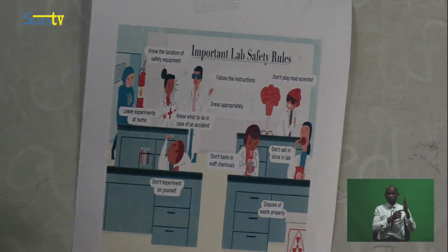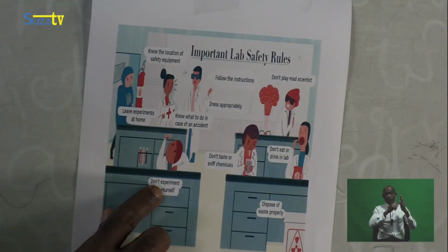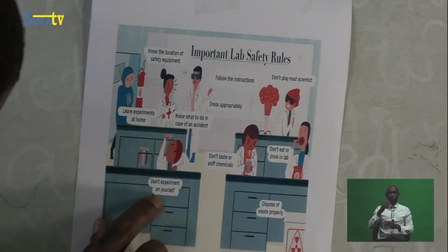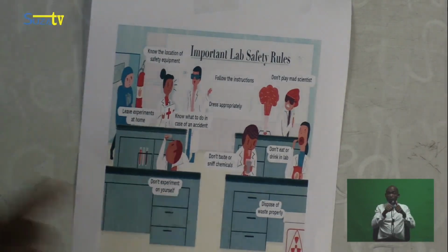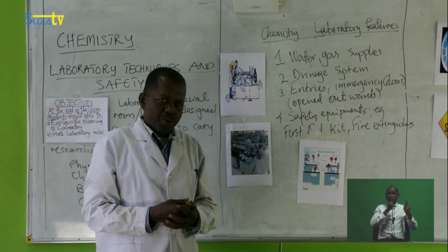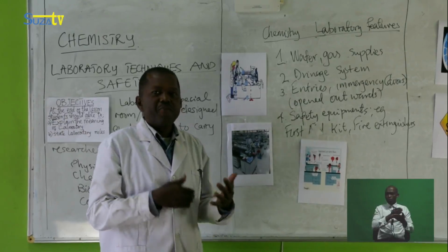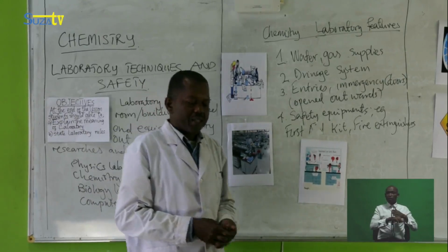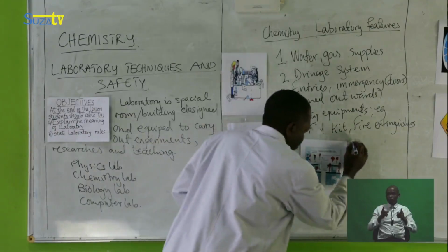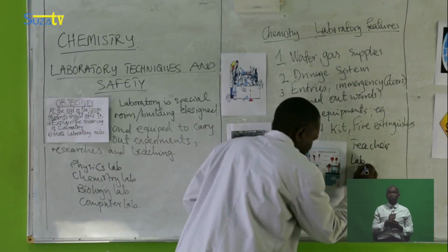We have one among the statements says, don't experiment on yourself. It means that if you want to carry out experiment, make sure that you have been informed either by a teacher or lab technician.